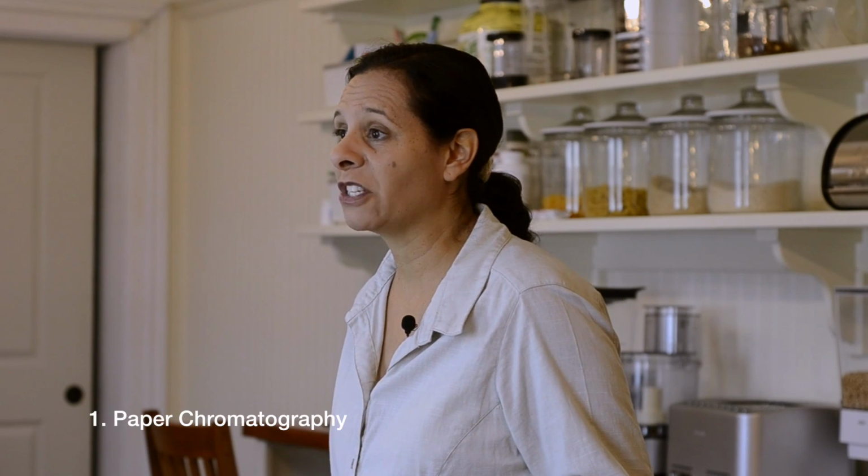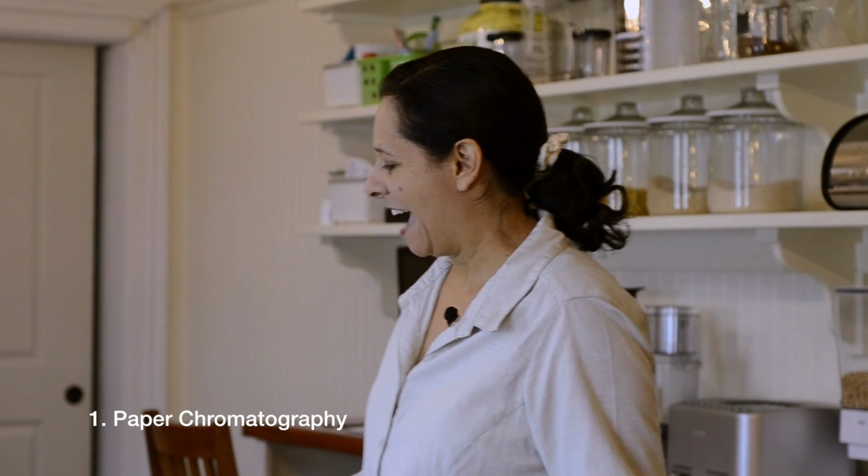Students of honors chemistry, I thought I would video our first lab together to see how this goes. We've talked about this in class already today. Our first experiment is going to be a paper chromatography experiment, and hopefully you are ready to roll. So this is my demonstration for you.